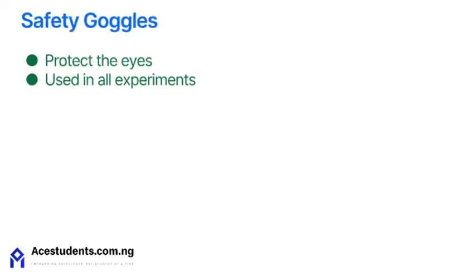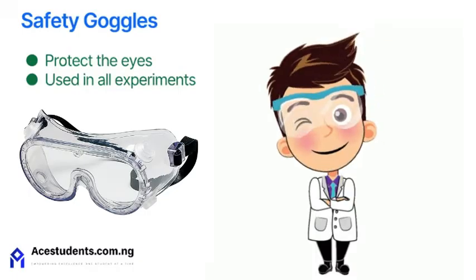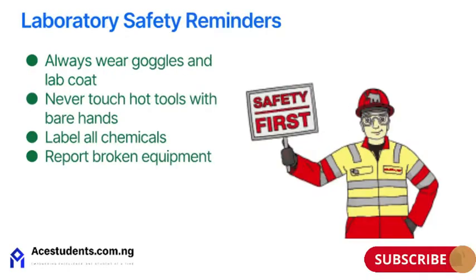Lastly, safety goggles. Goggles are crucial. They protect your eyes from splashes, fumes, or flying particles during experiments. Safety first is safety always.